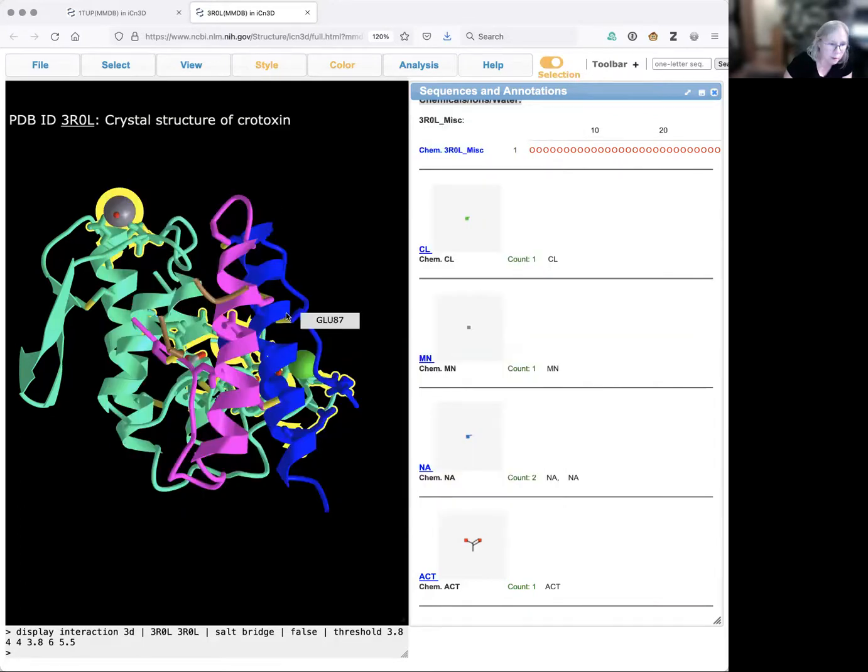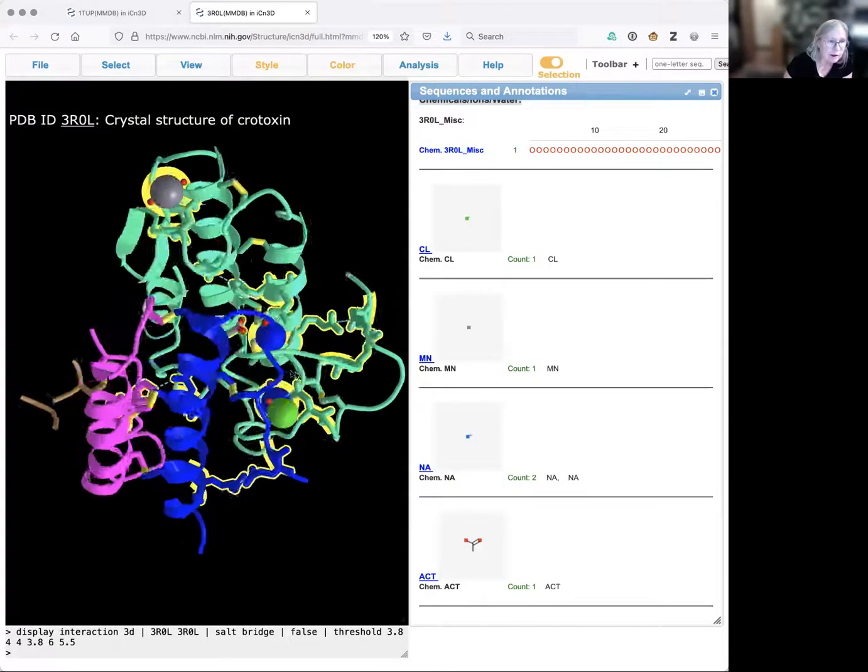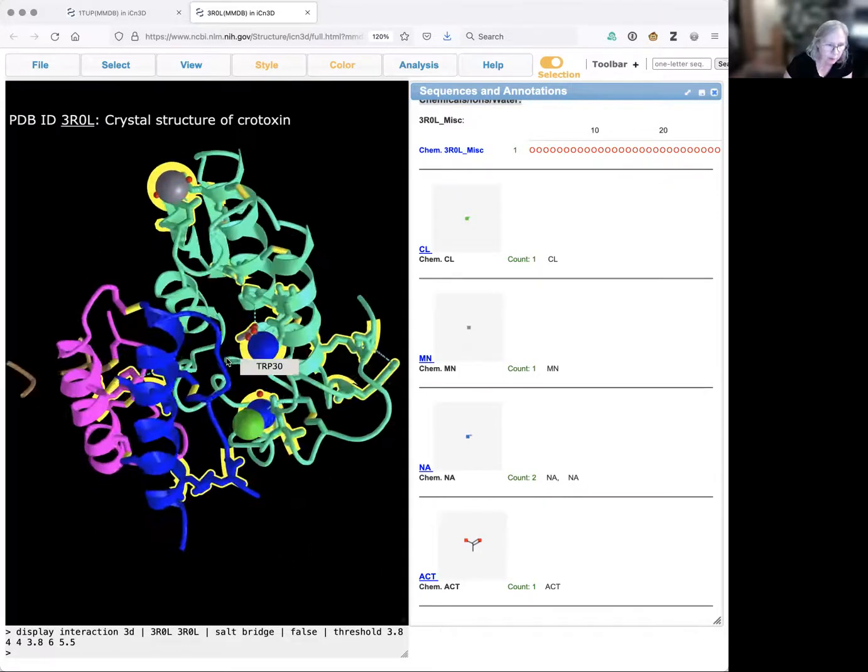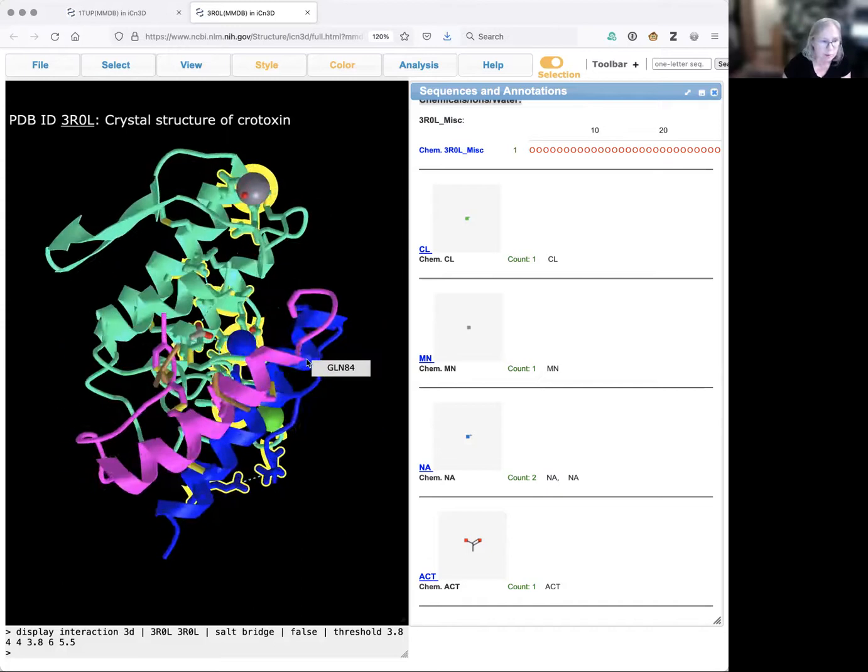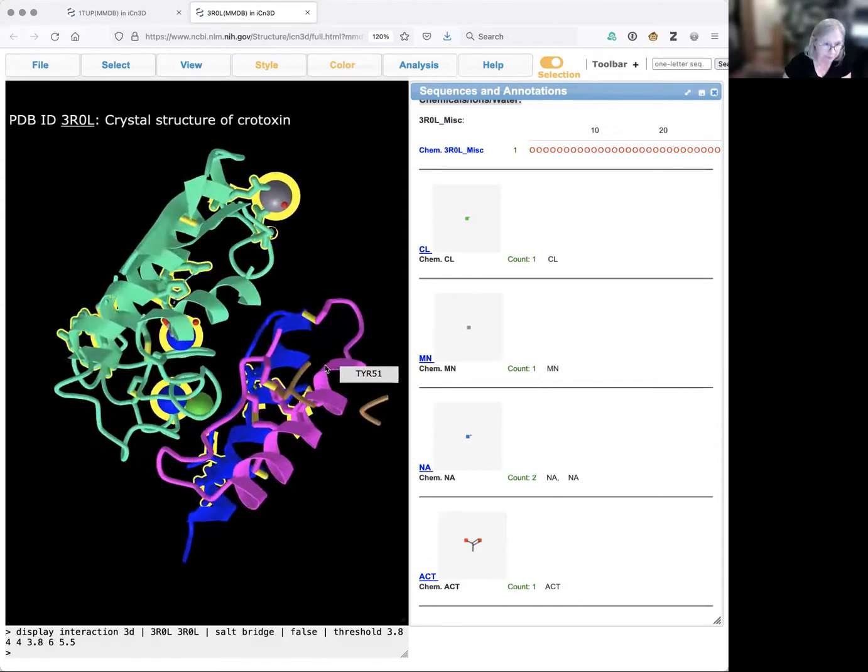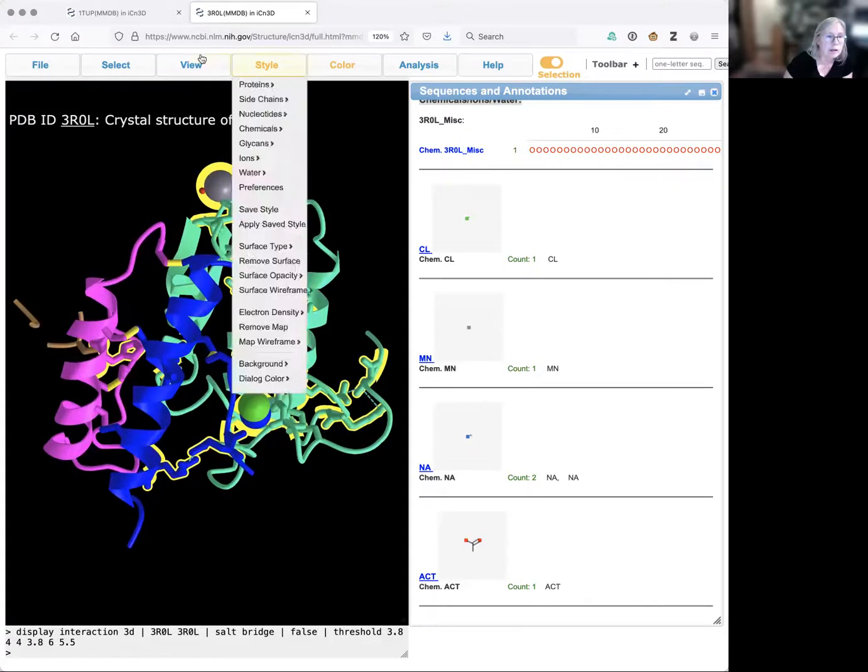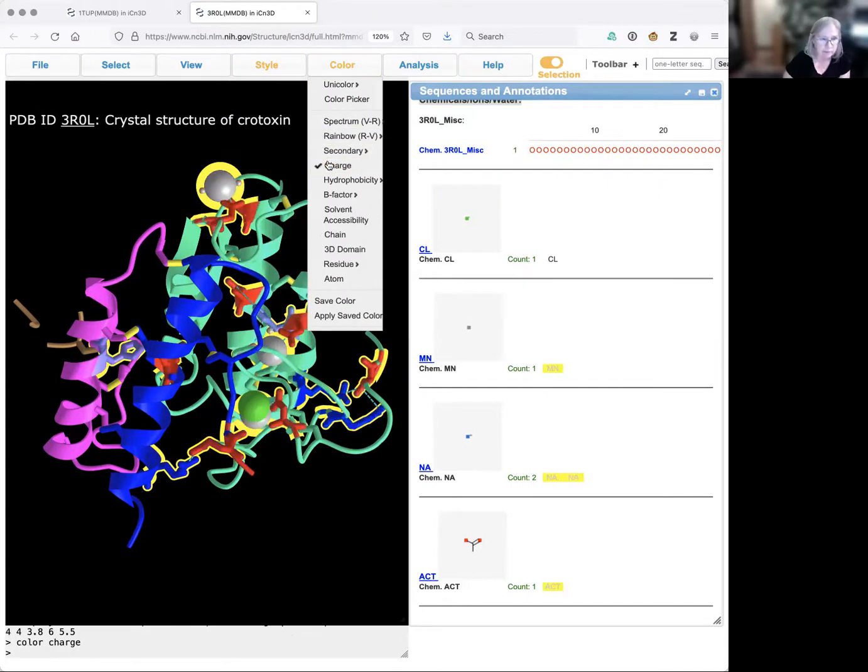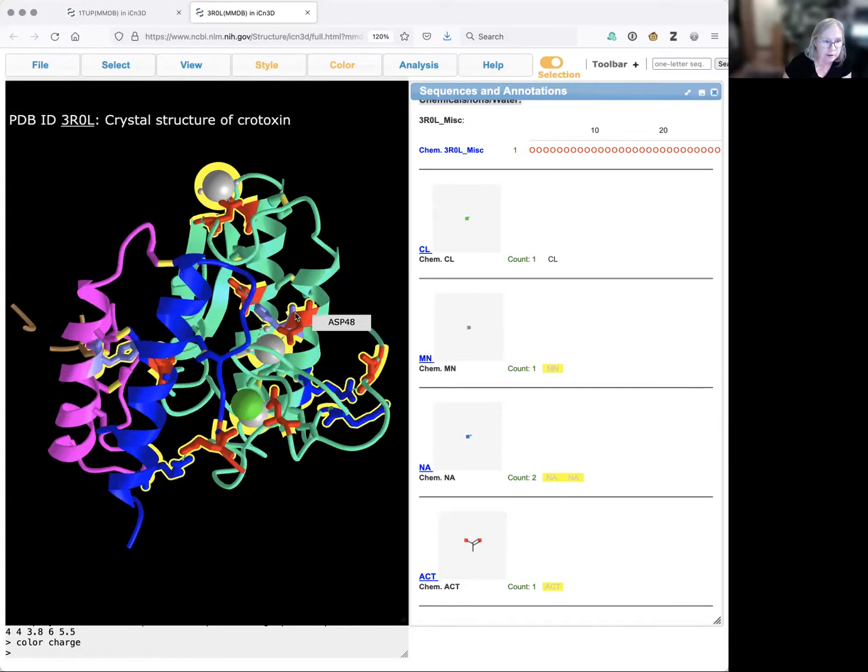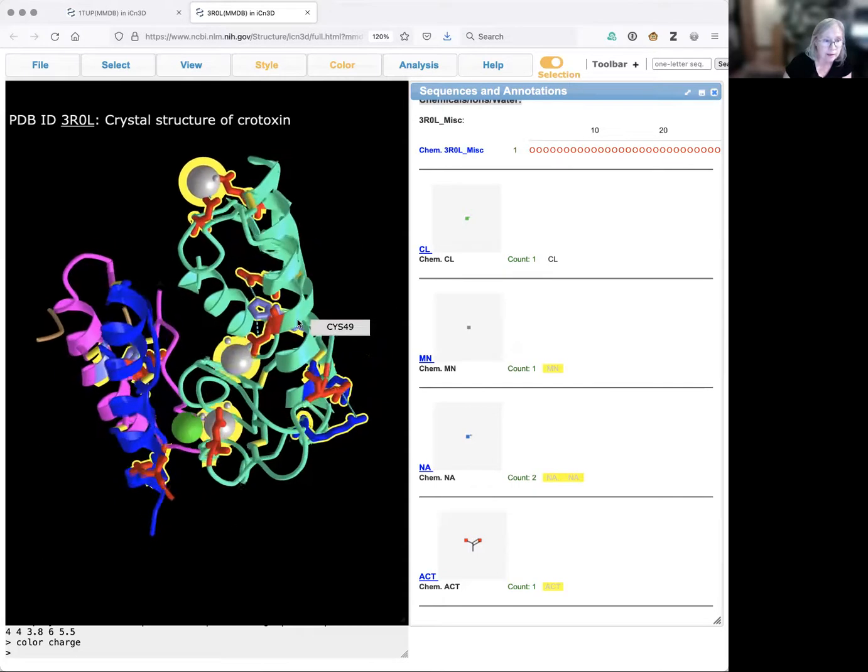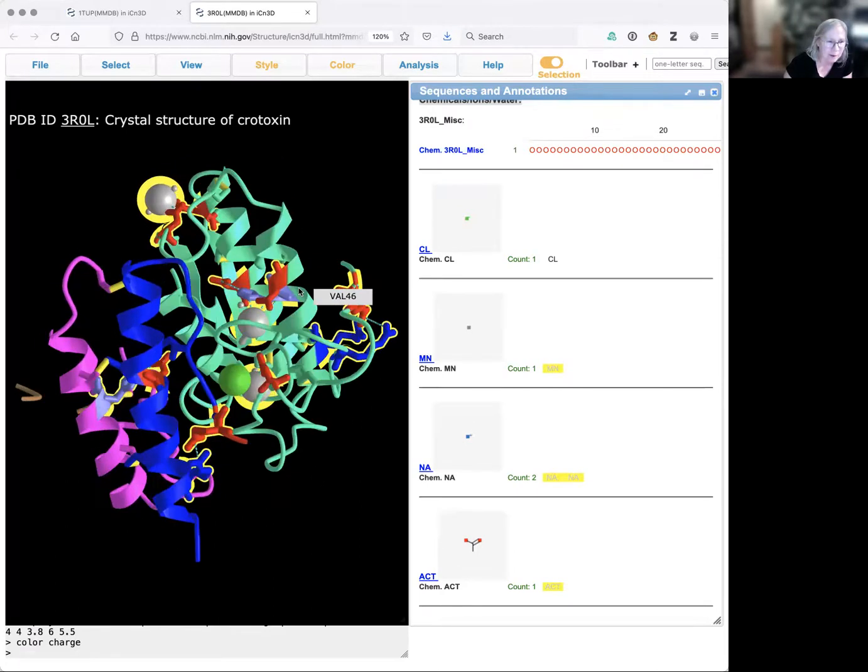We're going to look at the structure. You can see I've actually highlighted some metals here. We're going to ignore those because we're just looking for salt bridges between amino acids. I will change the coloring style to color by charge so I can see the things that have a negative charge and the amino acids that have a positive charge, and amino acids like histidine that have a positive charge but not as much.